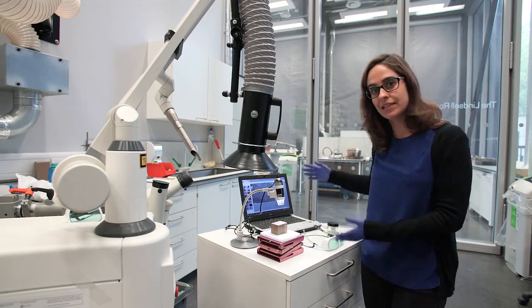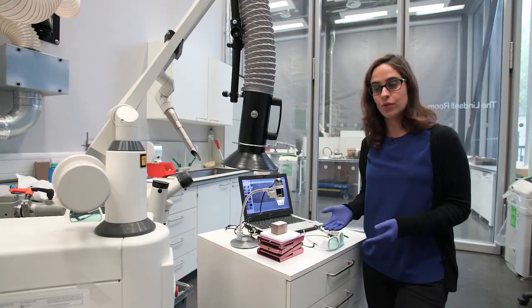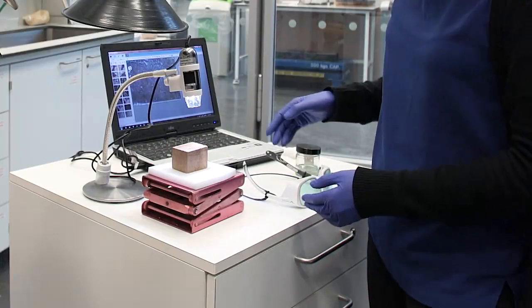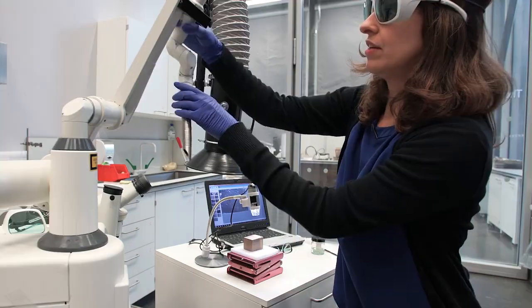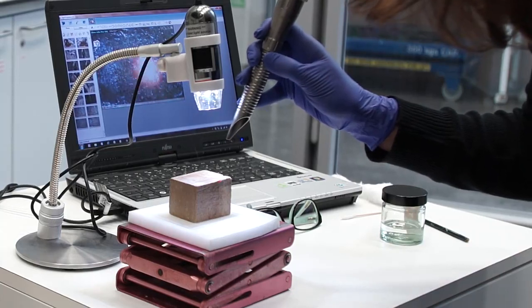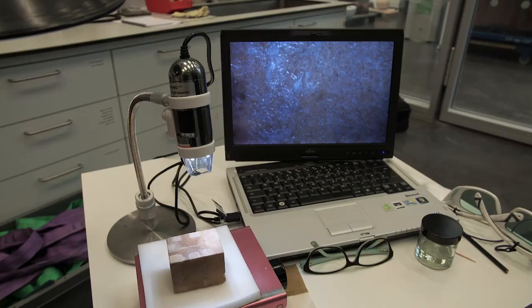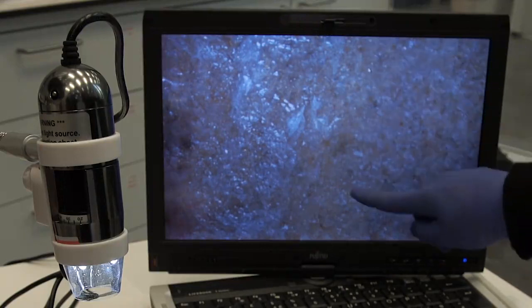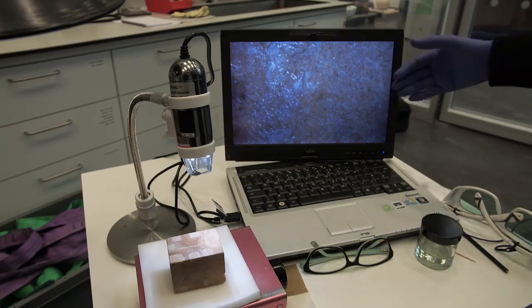Now I'm going to show you the typical setup I use for laser tests on the samples. One possible goal is to investigate whether the laser is efficient to remove a particular material. I generally place my sample on a platform that I can lift, and I monitor everything with a digital microscope so I can follow what's going on on the surface on the screen. After the treatment you can clearly see a difference between the coating and the irradiated area, where we managed to thin the coating so the stone becomes much more visible.